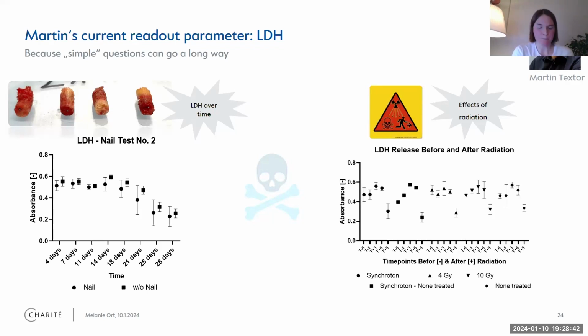Another thing was just to show that we are thinking in different directions and what's possible. I told you that we use a lot of synchrotron radiation, which is X-ray. So we were also curious, how is transporting the chip affecting it? Because if you do CT or synchrotron, you have to transport the samples as well. And we just wanted to see whether that's affecting the system. So it's nice to see that one assay and one good idea can answer a lot of first research questions.